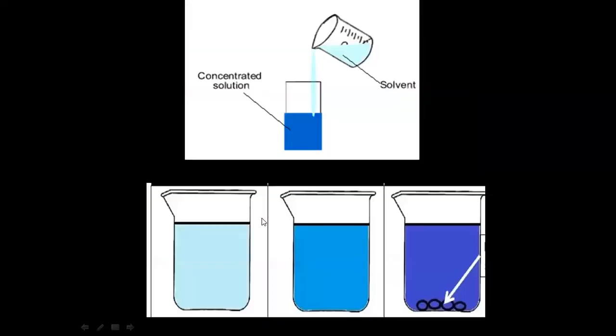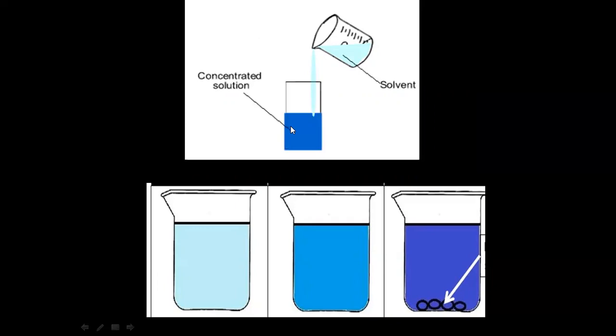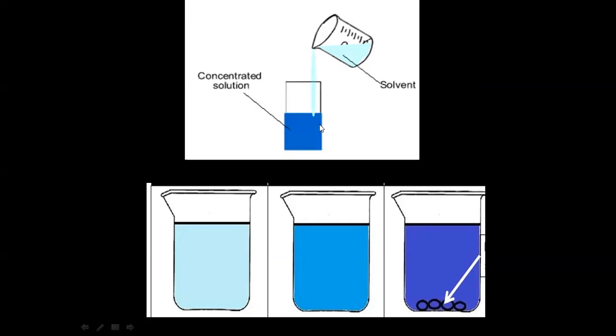Whereas in the case of organized drug, every day when you follow a process, maybe at the first batch when you go for filtration, the extraction gives a strained liquid, and when you press the marc, assume I have three individuals. I'm taking 100 ml of menstruum, and after extraction, the first person pressing the marc gets around 80 ml. The second person gets around 90 ml, and the third person gets around 95 ml.